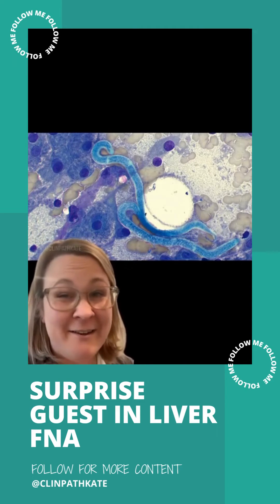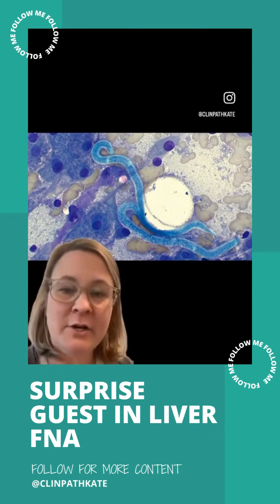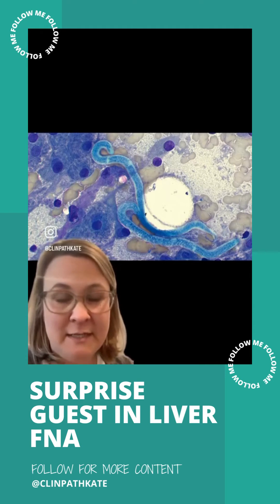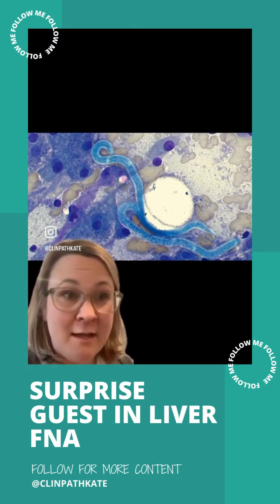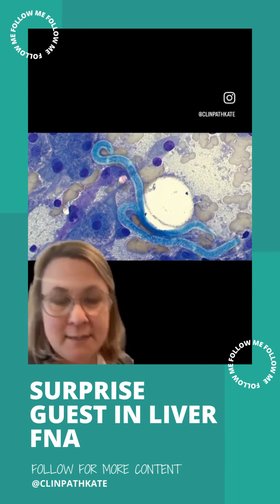In these cases, it can oftentimes be confused for — oh, is this like a worm that's in the liver? Or sometimes you might catch this if you're doing a mass aspirate in the skin or something like that, and it may make you think: is there a cutaneous, or in this case, hepatic parasite happening here?